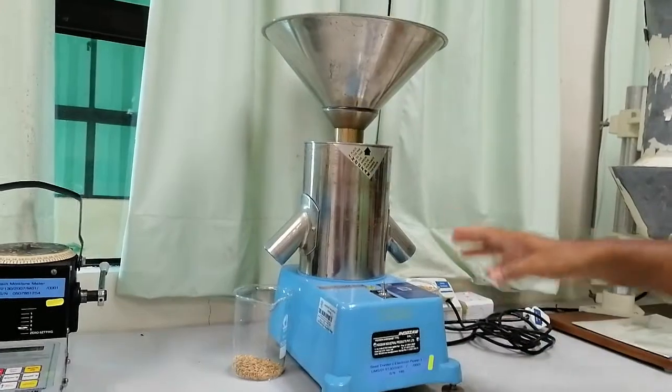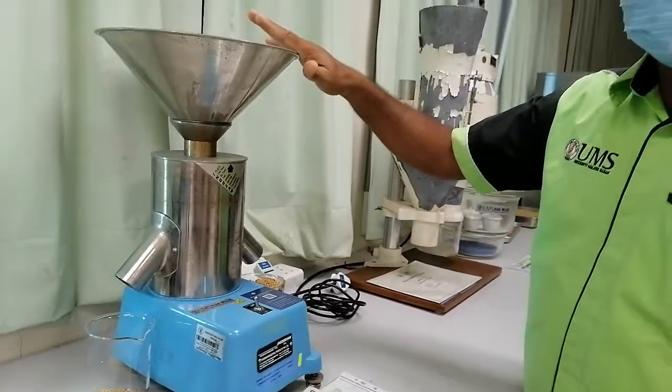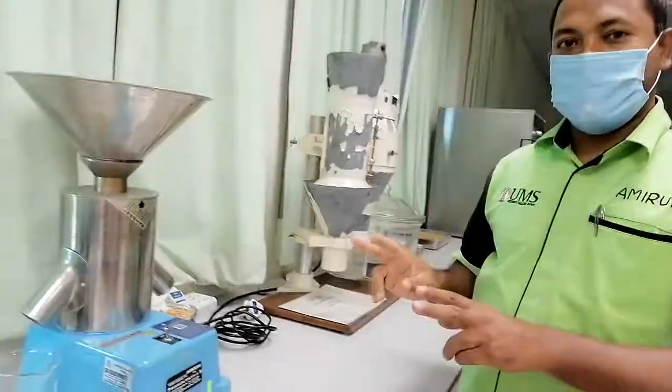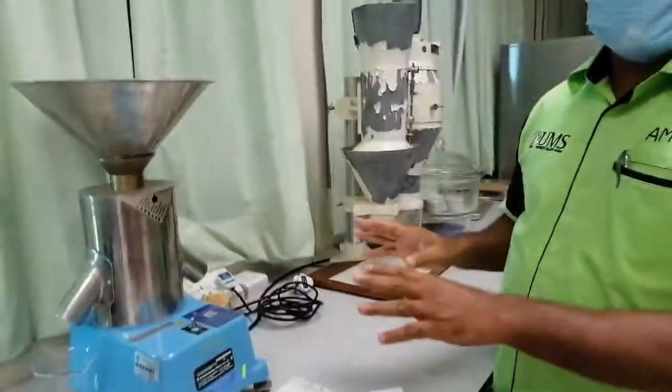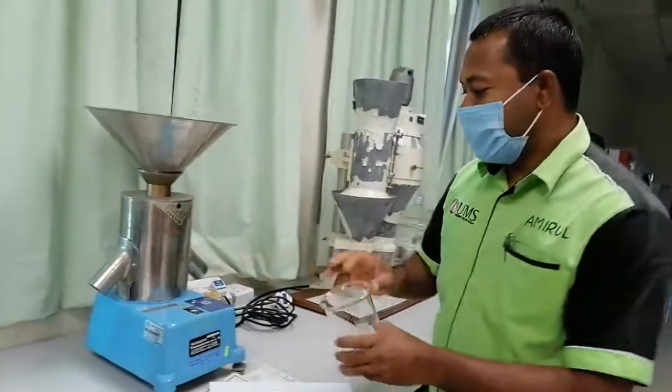We can divide the seed into two halves. Suppose if we give one kilogram of seed, they will divide into two only. There is no second option — only divided into two. Now I want to show you how we can divide.